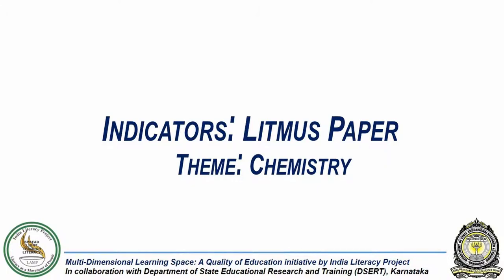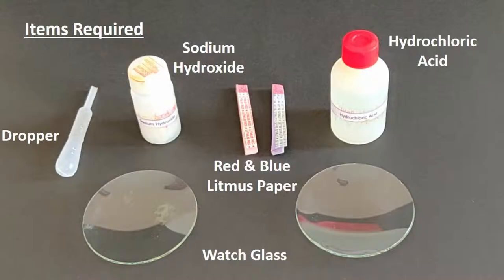In this experiment, we are going to investigate the acidic or basic nature of two liquids. For this, we need sodium hydroxide, hydrochloric acid, red and blue litmus paper, a dropper, and watch glasses.